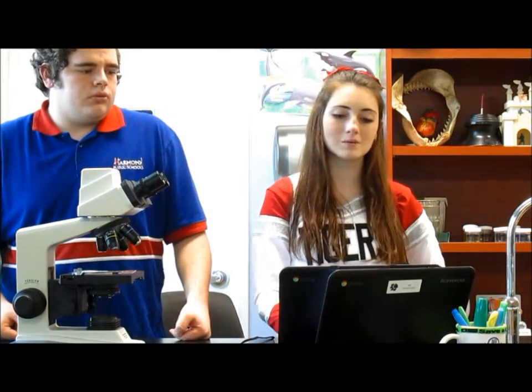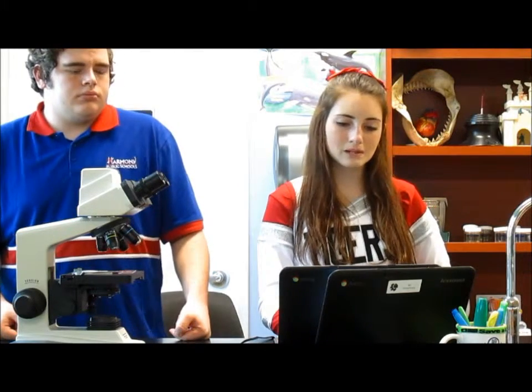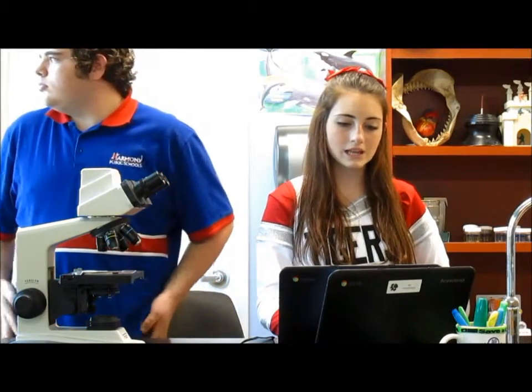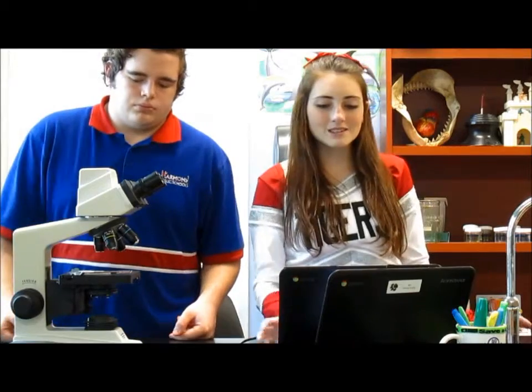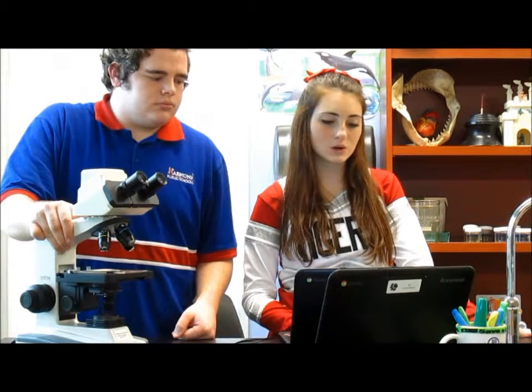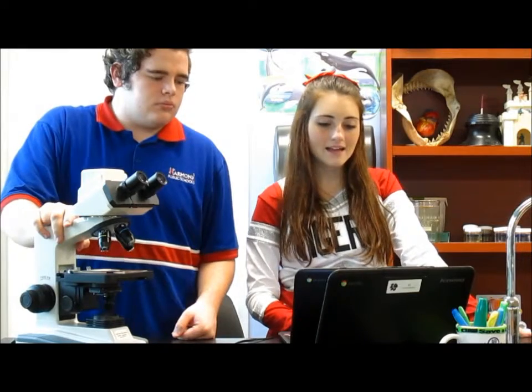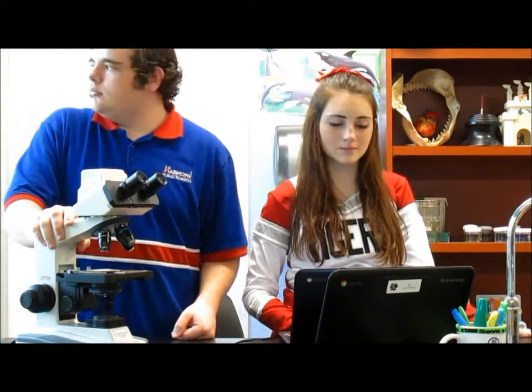An electron microscope depends on electrons rather than light to view an object. Electrons are speeded up in a vacuum until their wavelength is extremely short, only 1/100,000 of that of white light. Electron microscopes make it possible to view objects as small as the diameter of an atom.